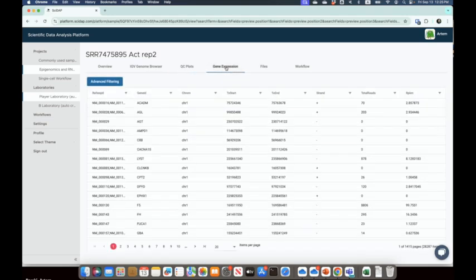Of course, you get a gene expression table, and we actually calculated it 3 ways. First, we start by calculating gene expression for gene isoforms, and then we can sum them up by either gene or by common TSS. And I guess this depends on what you are studying.